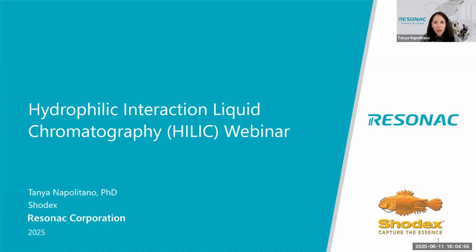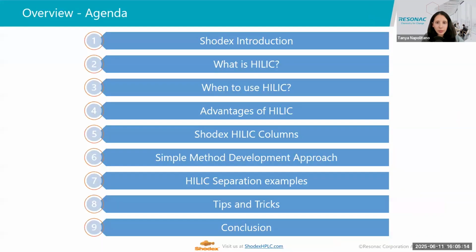Today, we'll explore the fundamentals of HILIC, how it works, when to use it, and why it's become such a powerful tool for analyzing polar and ionizable compounds. So whether you're new to HILIC or looking to optimize your method, I hope you'll walk away today with clear, actionable insights. So let's get started.